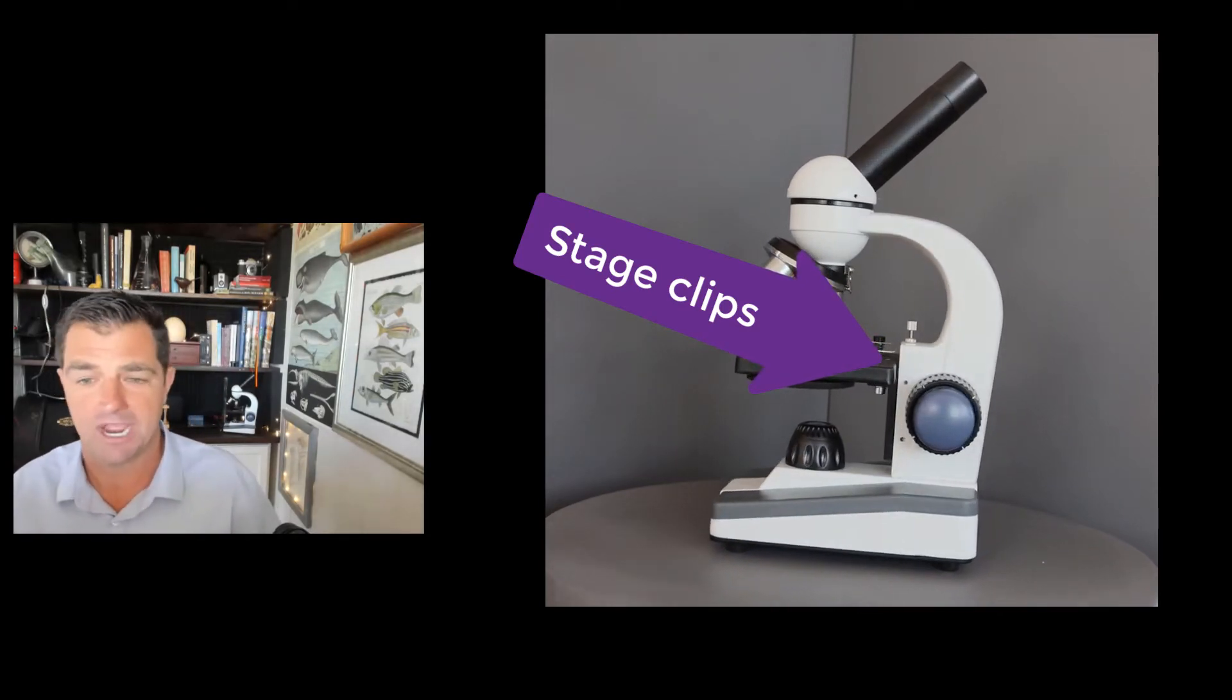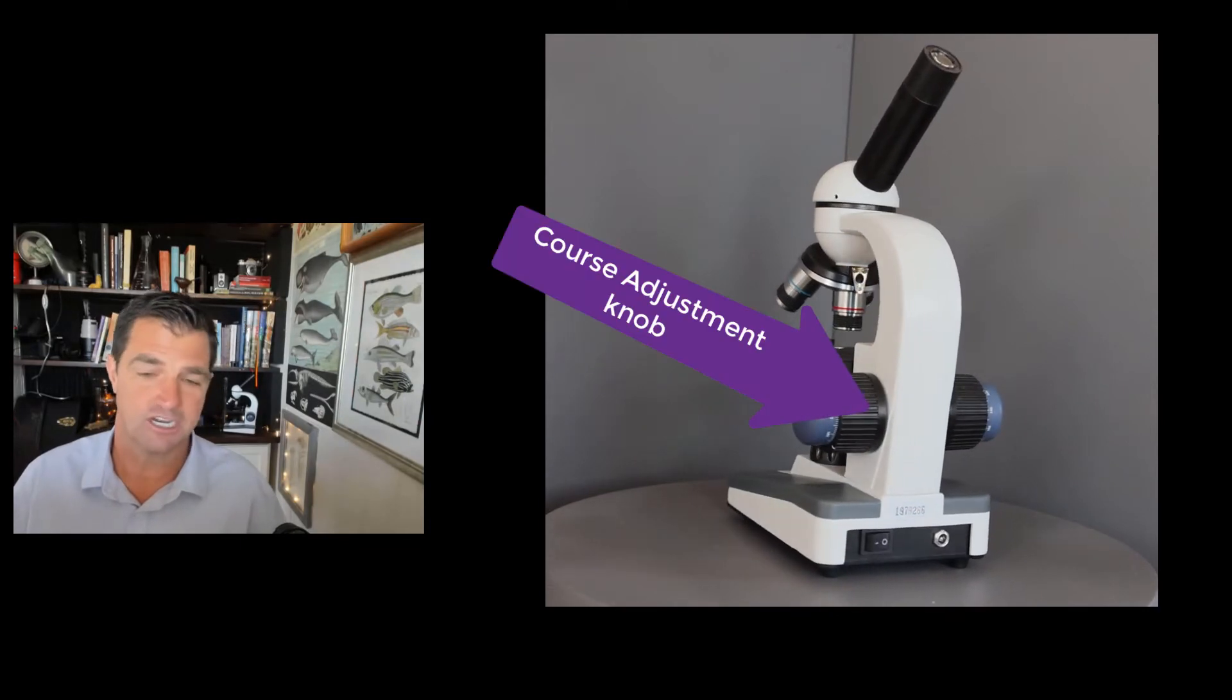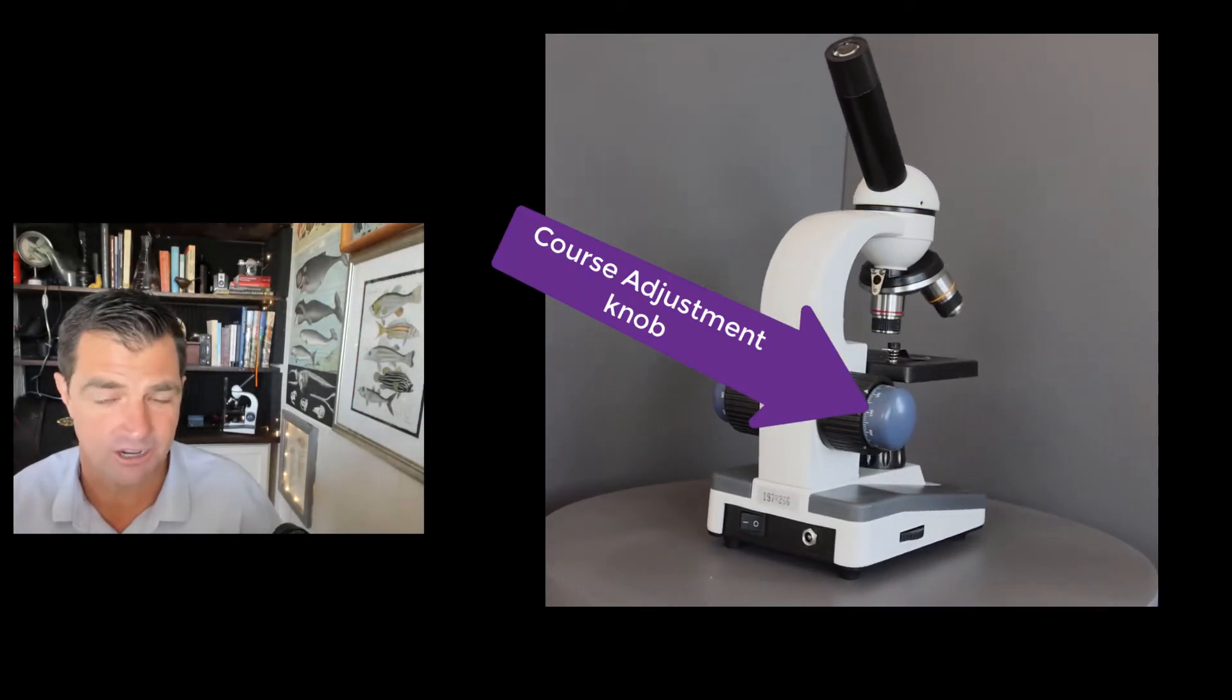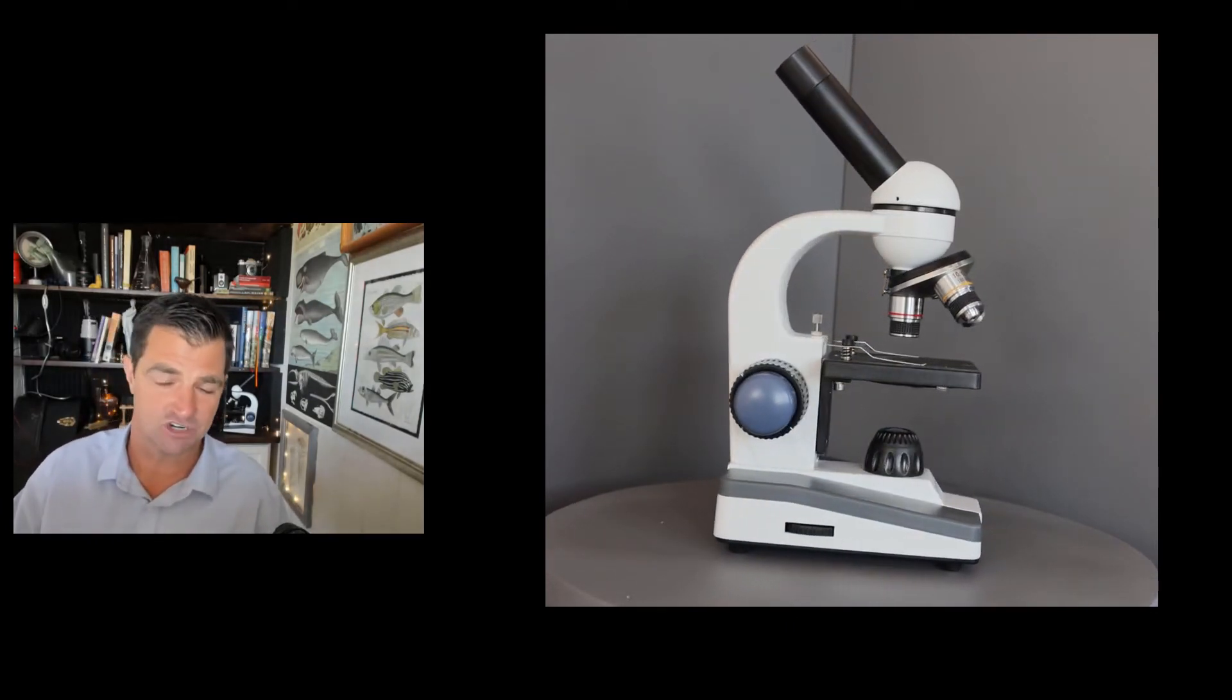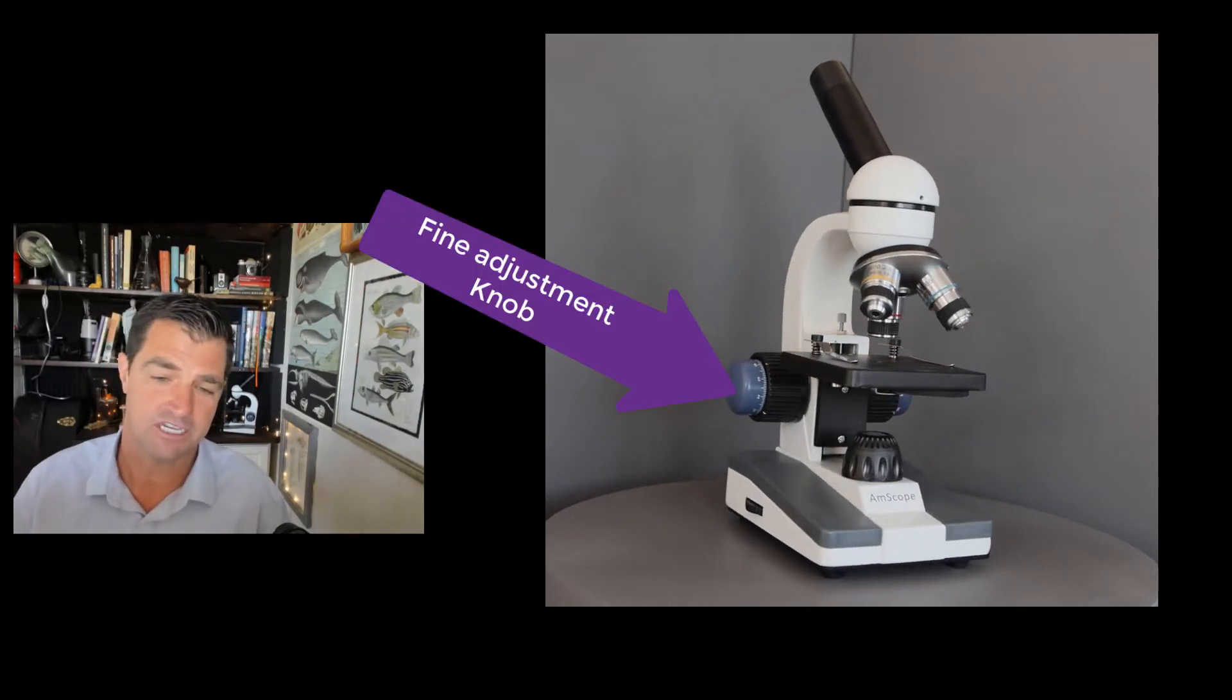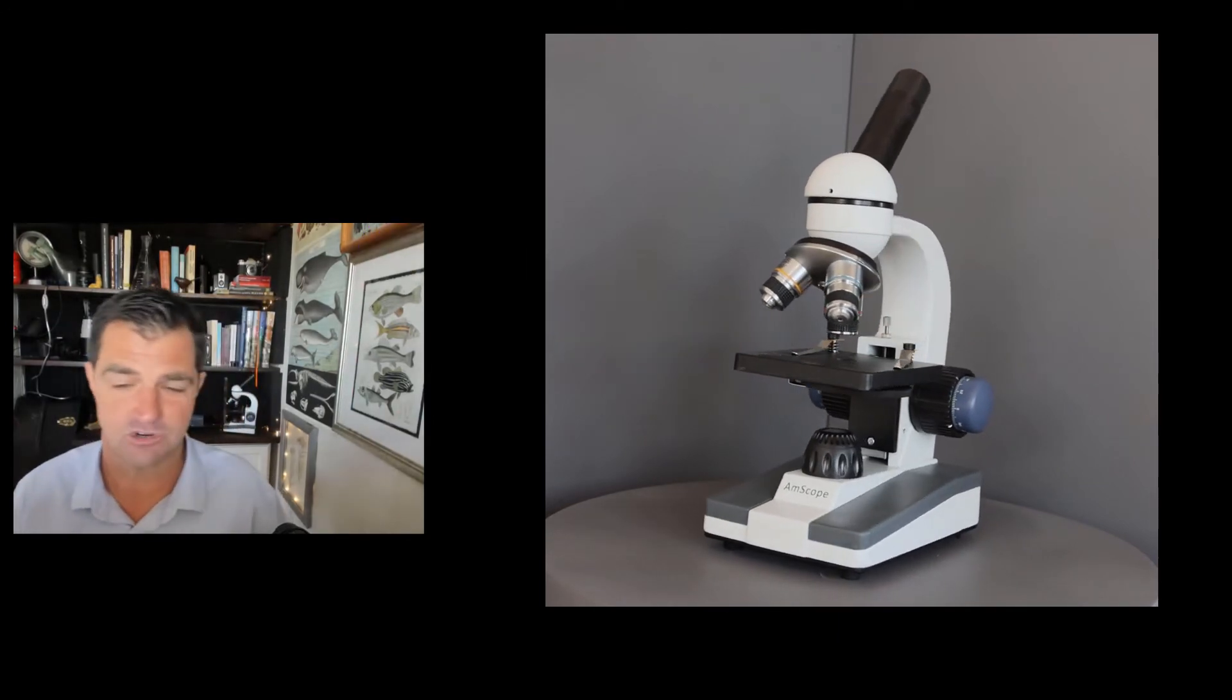The innermost knob is called the course adjustment knob, and when you turn it, it moves the stage up and down. Outside of that one is the fine adjustment knob, which is used for fine focusing your specimen.